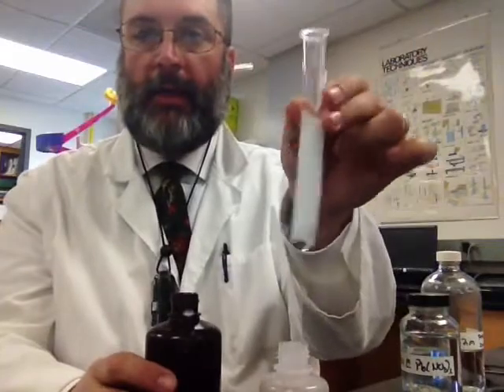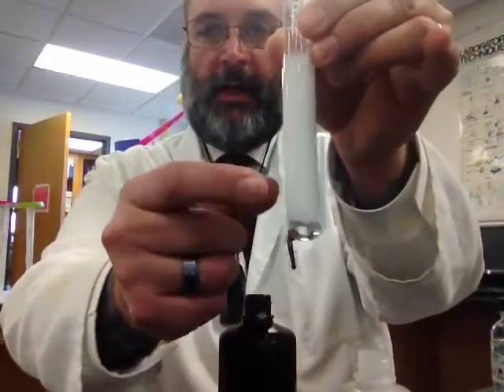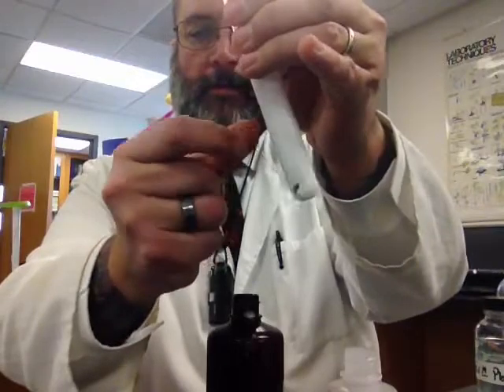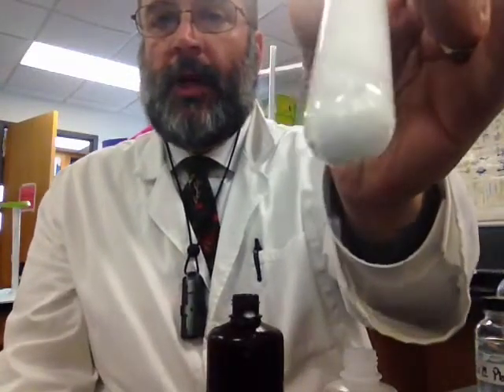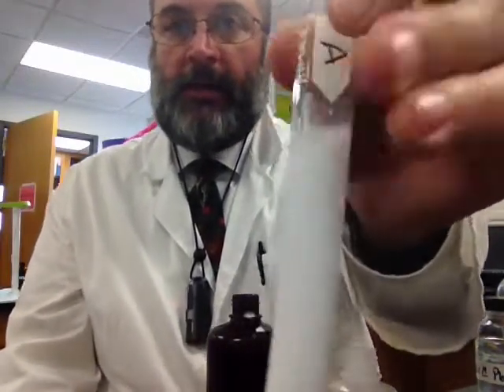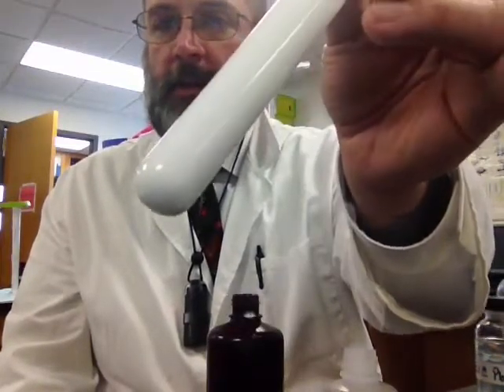See? Right away, we get a change. Look at that. Now, if I mix it a little bit, I can get rid of this little section at the bottom that hasn't done anything. See that? There we go. And what do you see at the bottom? You see a precipitate. Okay? So all that white color in there, that's solid, and you can kind of see a little bit of it at the top there, clinging to the sides, and you can definitely see it gathering at the bottom.